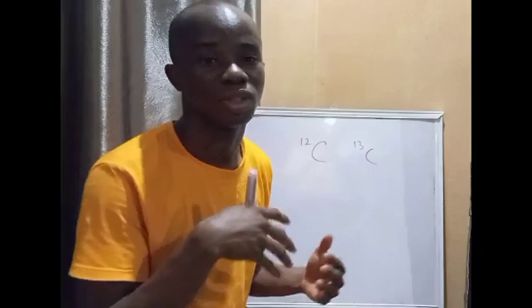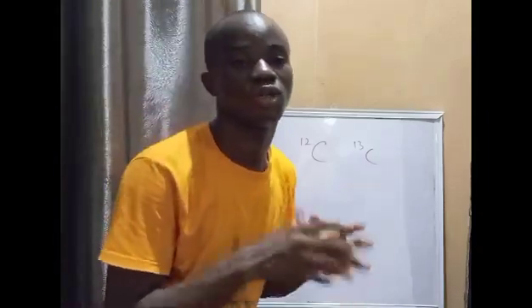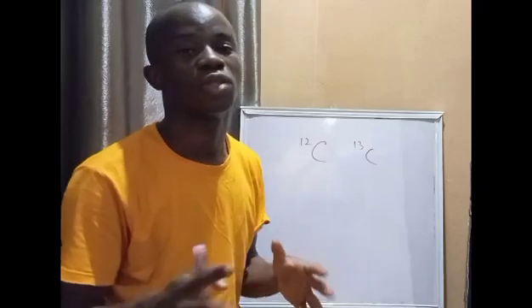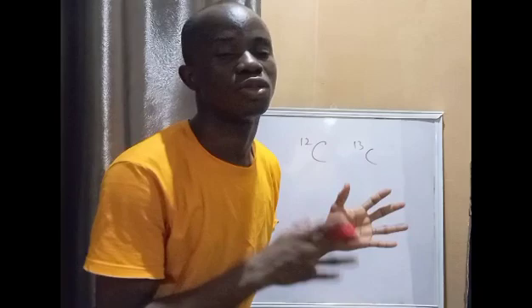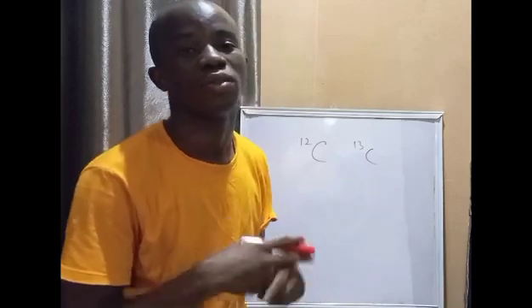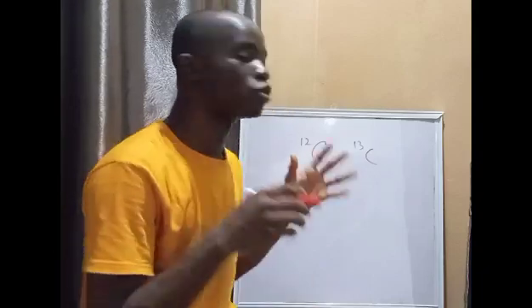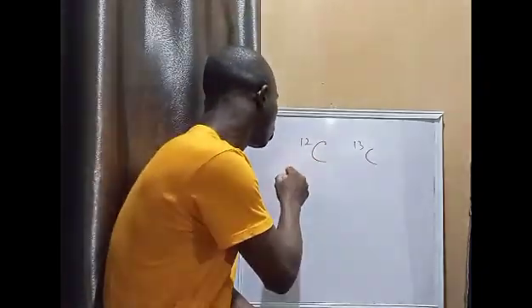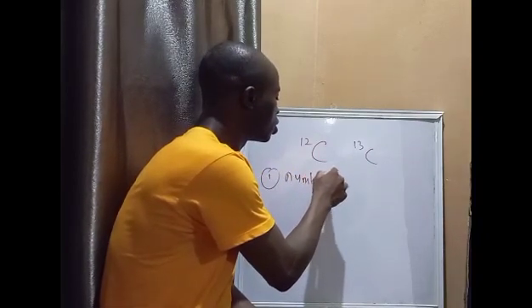And the last one is the integration of the signal. Each of these points I'm going to explain one by one and how they help in elucidating the structure of any compound represented by the given NMR spectrum. So to note those four points, I talked about the number of what? The number of signals.